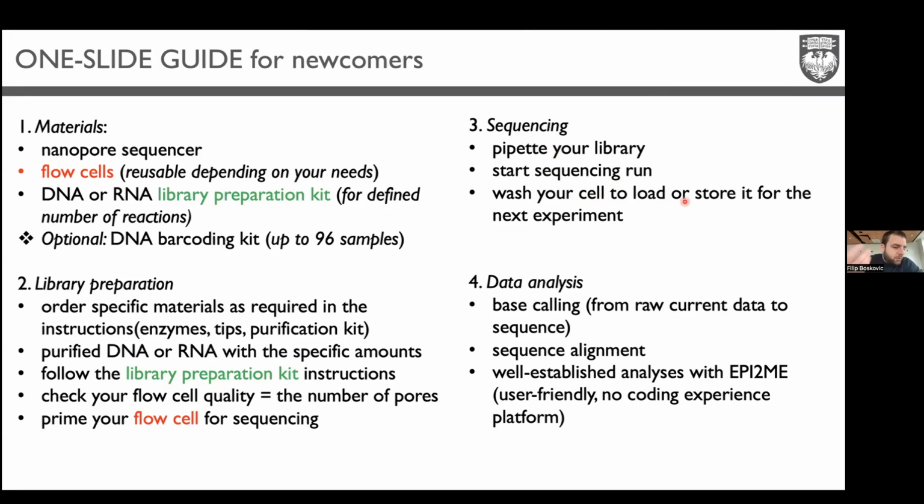As I tell you, you can immediately put another sample once you're happy, or store it for the next experiment. So it's, of course, up to you. Usually I think the company says 5 times, but if you're really stingy, some people doing plasmid sequencing, like core facilities, actually wait for samples together, like hundreds of samples. Then they sequence for 1 hour, then clean it, and then they use it a lot of times until actually they get the last pore dead.